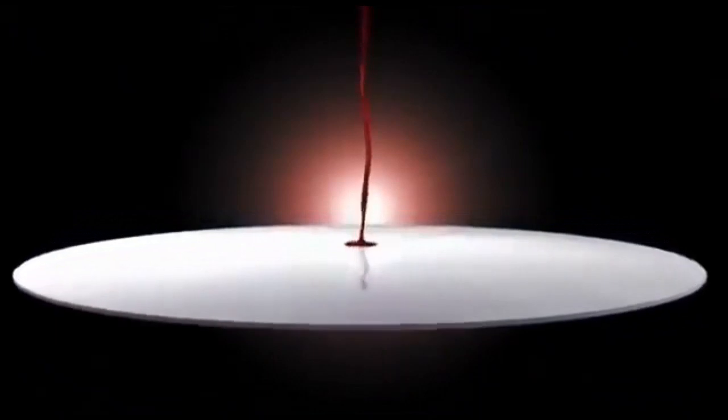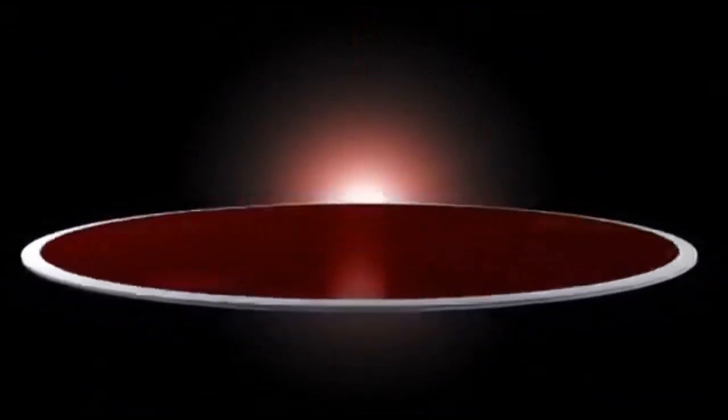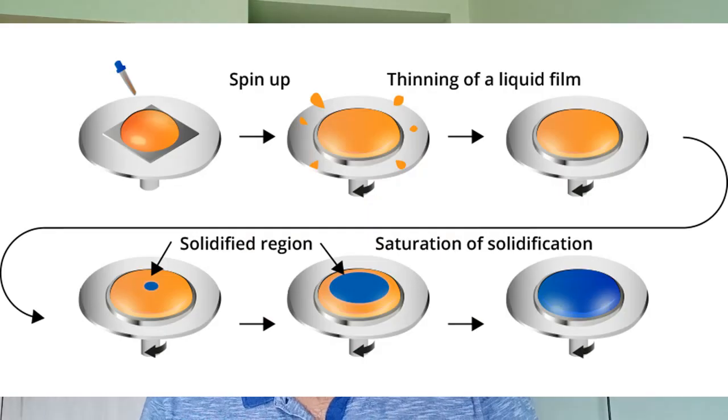Another is spin coating. In spin coating, our substrate, on which there is a chemical or photoresist, is spun at a high RPM such that a uniform thin layer forms. The layer which forms on the substrate needs to be very uniform. In industry, mainly spin coating is used.